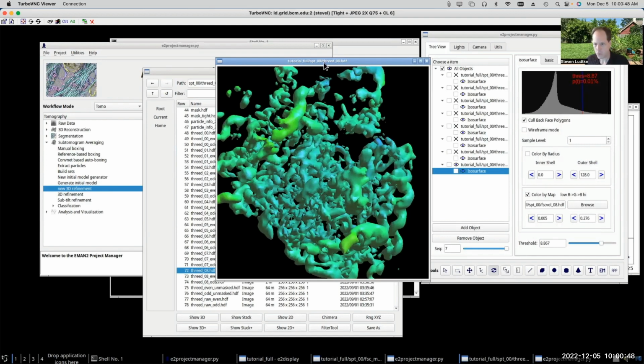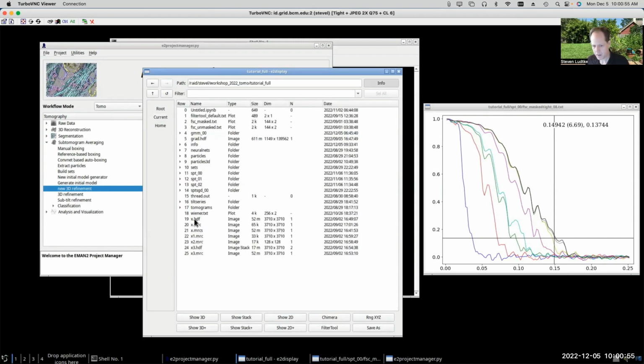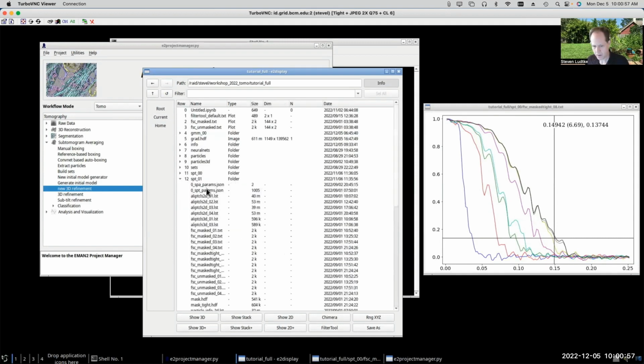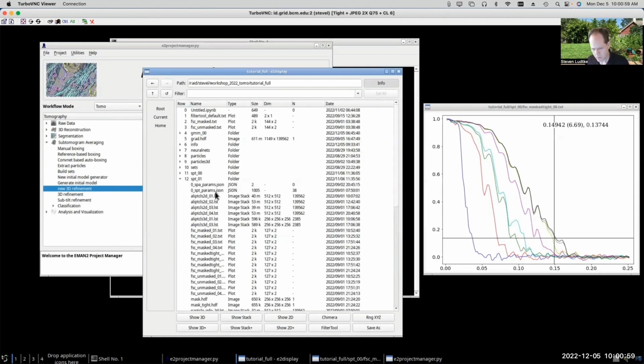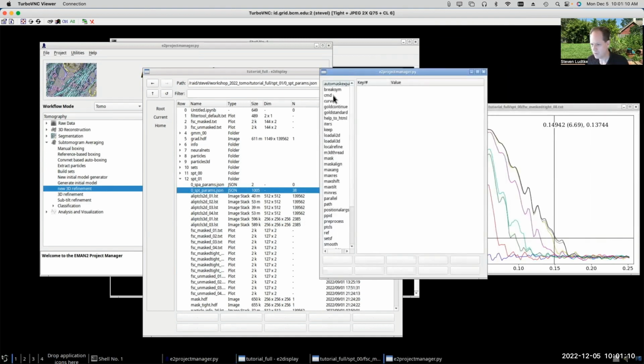Now, what about the other runs I did? Here's the plot again from this first try that I did. This one. I wasn't selecting. Okay. There we go. So this one I ran PT, and I did a global top hat filter.